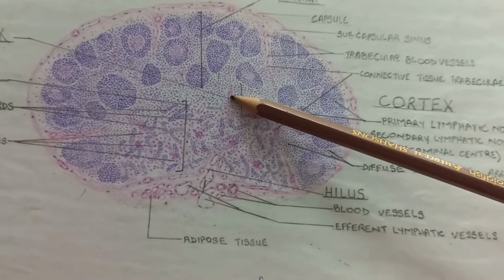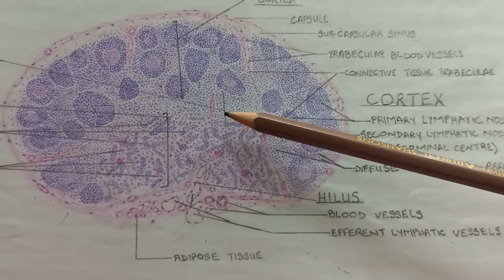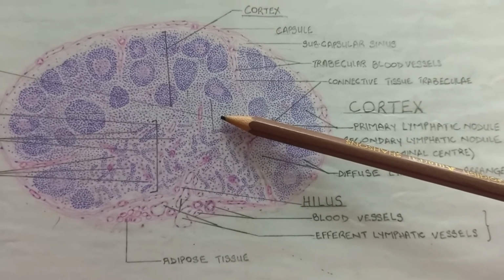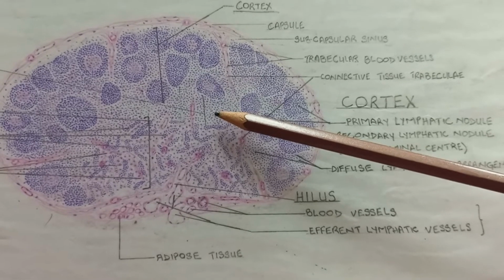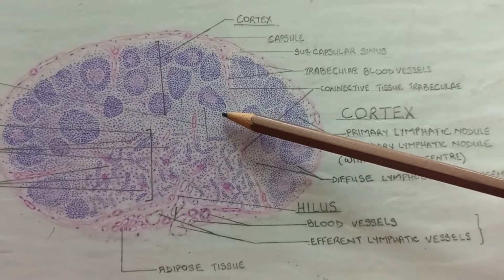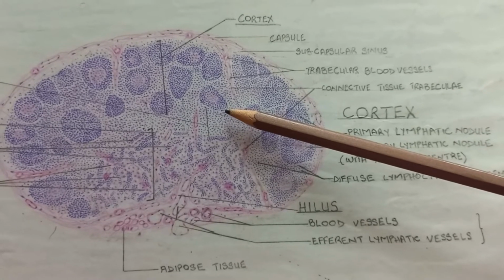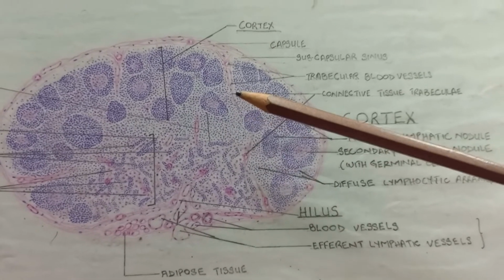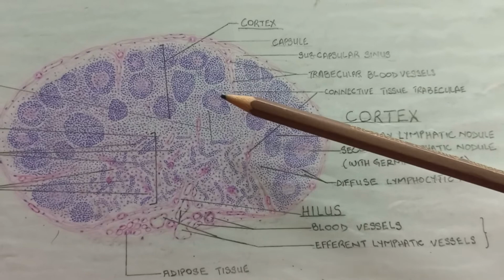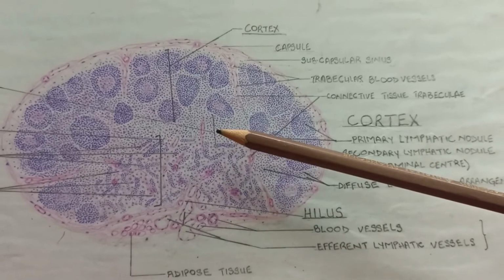Then comes the paracortex or the deep cortex. In the deep cortex, you will find the high endothelial venules. Here you will find most of the T lymphocytes. And the high endothelial venules, which are the important feature of the paracortex, are lined by simple cuboidal or columnar epithelium. This part of the paracortex, which has the high endothelial venules, allows the migration of lymphocytes from the bloodstream into the paracortex. 90% of lymphocytes enter the lymph node through this paracortex, and B lymphocytes will move to the superficial cortex while the T lymphocytes will remain in the paracortex.